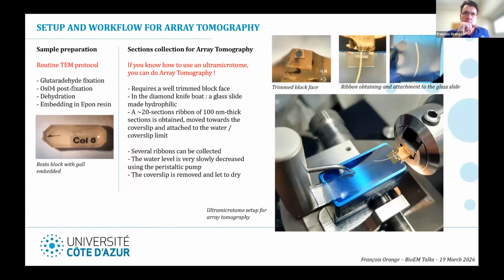I would say the same tricks that you can use for common ultrathin sectioning can be applied for this. I know I haven't tried. You can play with some chloroform vapor to stretch the section a little bit and avoid the wrinkling. Some people put a few drops of ethanol in the boat of the diamond knife. So there are many tricks which I think can apply to this. I haven't used a specific thing to avoid wrinkles, so I had wrinkles.